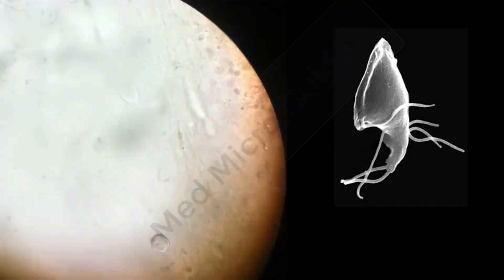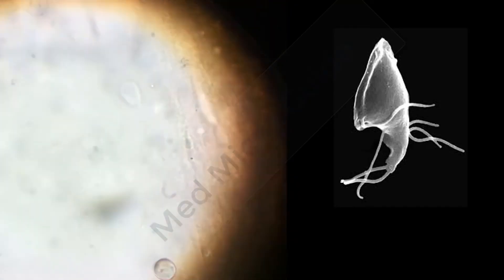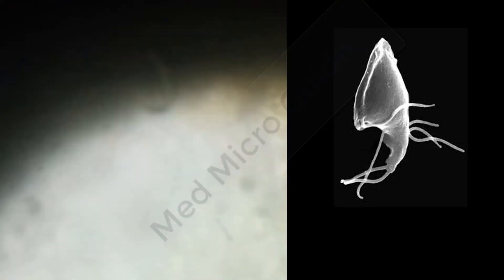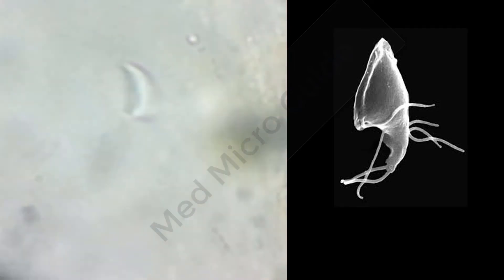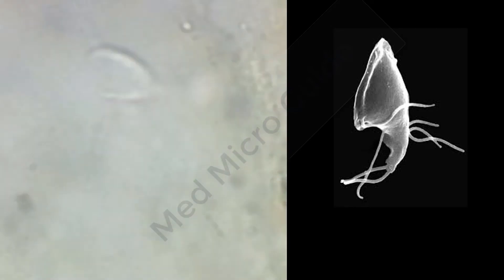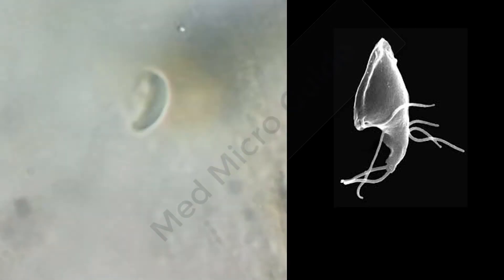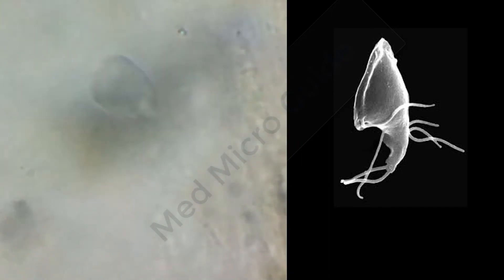Now I am doing the 4x optical zoom. You can see the morphology of the parasite resembling the electron microscopic picture which I have put on the right side.